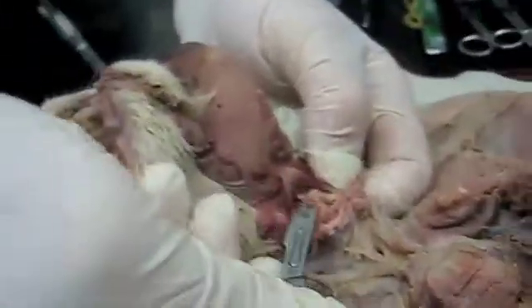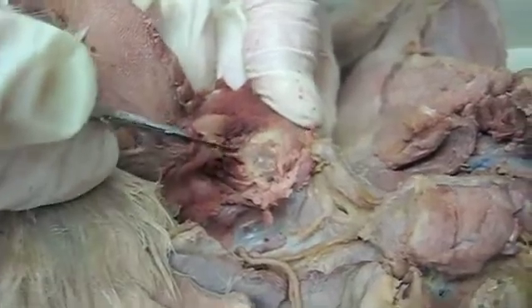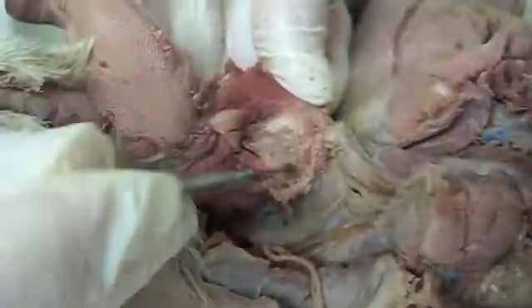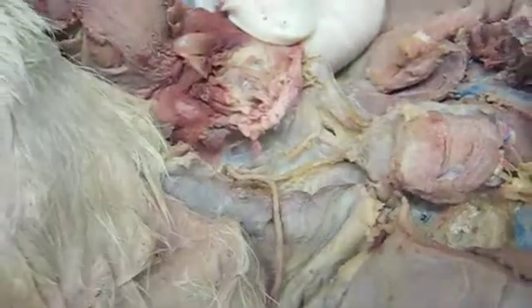If I can get at it here. Yeah, there's that slit-like glottis right there. So if you go on either side of the slit-like glottis, there's a little piece of cartilage right in here, which is the arytenoid. And it's all paired. But so the arytenoid is right here versus the cricoid is back here. And the cricoid is going to be posterior. The arytenoid is this little anterior piece on the sides of the dorsal side. Yeah, on the sides of the glottis. Where is the cricoid? Right back here. So all of this hard cartilage back here would be cricoid, and then the little piece up here would be arytenoid, and again, it's paired. They're on both sides.